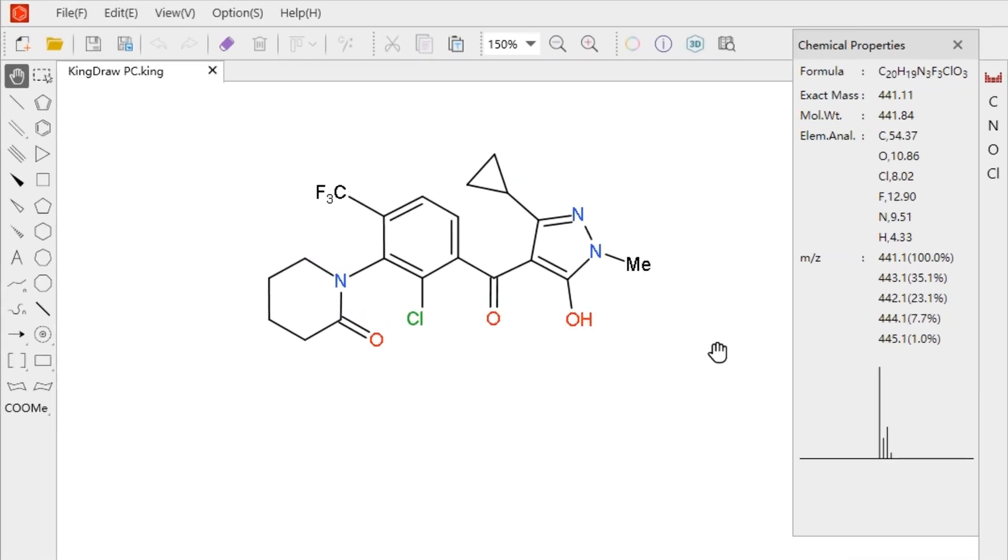In the chemical properties window, we can view the chemical formula, exact mass, molecular weight, elemental analysis, and mass-to-charge ratio of the compound.